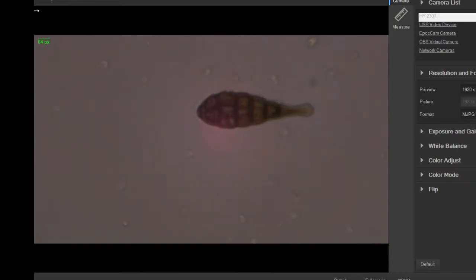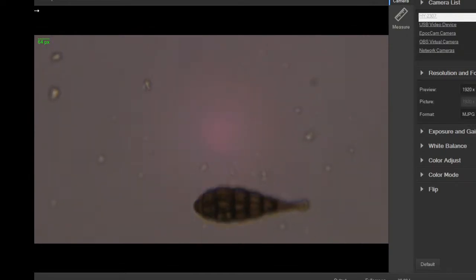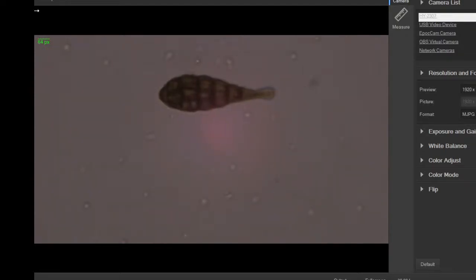Looks like a sporangium. If you saw my video on the fungi in the cheese and the fungi growing on the bell pepper, some of these structures came off the hyphae. This might be some kind of sporangium. Fungi are all over the place, so it wouldn't be surprising to find it in water because they blow around and get knocked around and could easily be found in water.